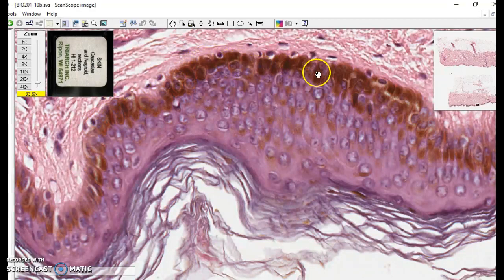There they are. And then there are more layers of cells. And these are, in fact, flat squamous cells. You could argue that these look more like cuboidal or columnar, and in fact they are. But this tissue is named after this top layer, which is primarily flat cells. And you might have to use your imagination a little bit. Maybe this guy could convince you it was squamous. And then there's this stuff.